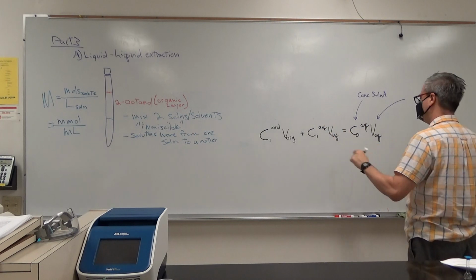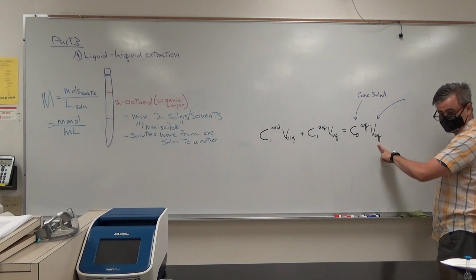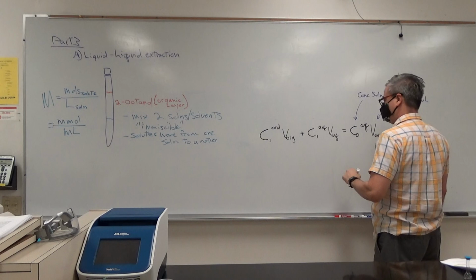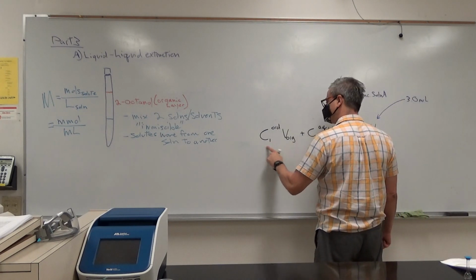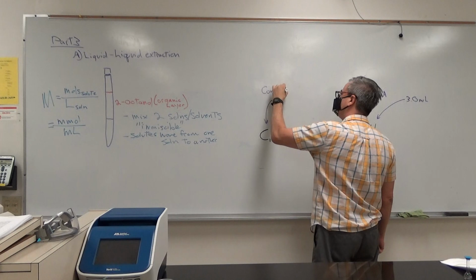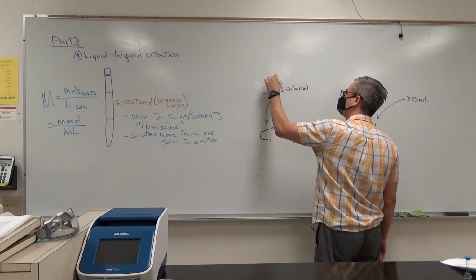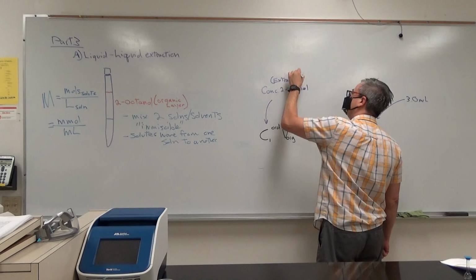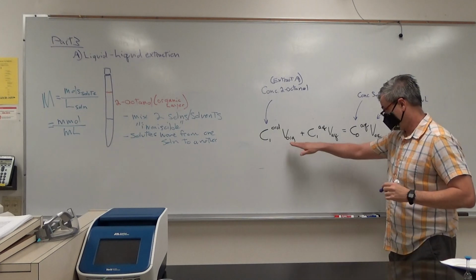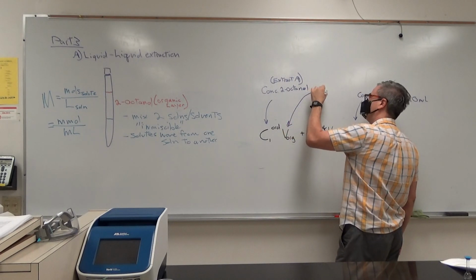I told you the volumes, right? So what's V aqueous? How much solution A do we use in this extraction? I mentioned it. It's 3 mils. We're going to use 3 mils. What do you think this is? The octanol? Yeah, that's the concentration in 2-octanol, of methyl violet. And what's that volume? 3. That's 3 again, yeah.